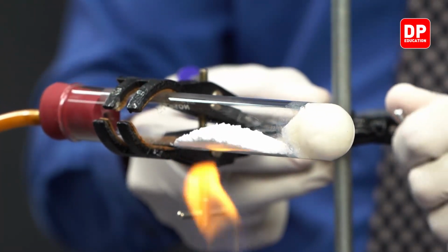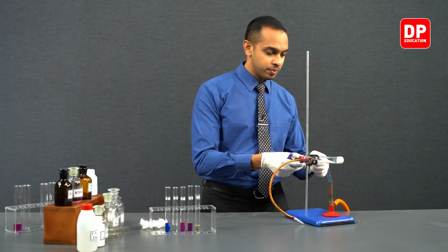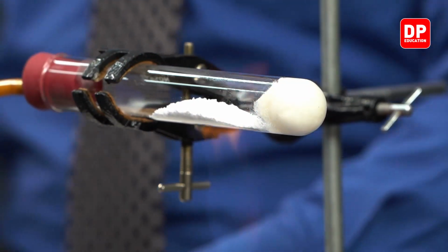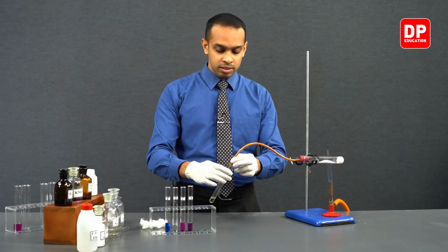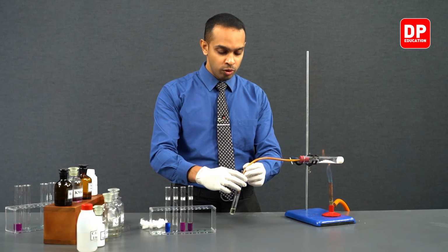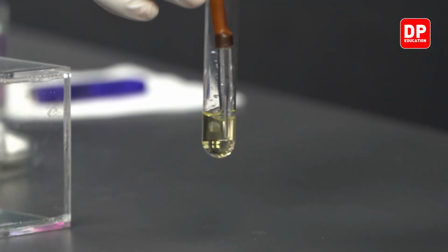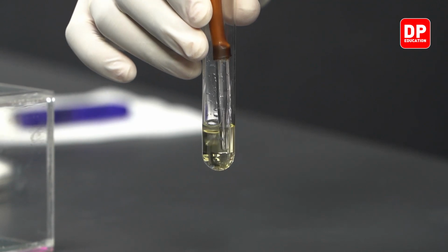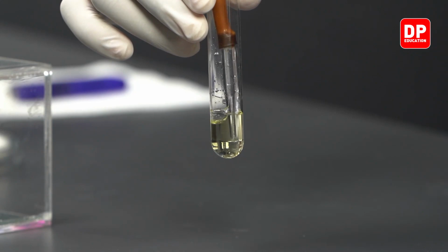We can lower the entire setup like this, and as we heat our alumina, we can insert this delivery tube into our bromine water. And as you can see, there's a gas that is being produced.